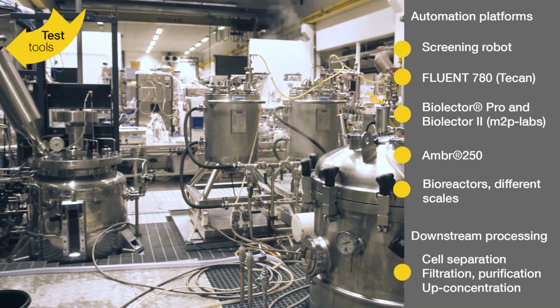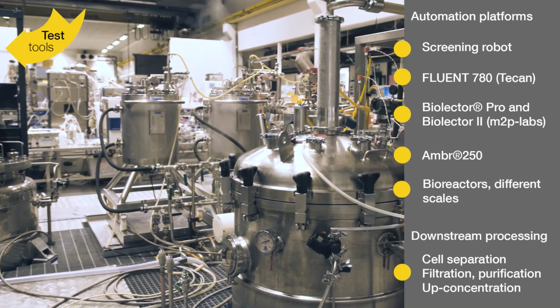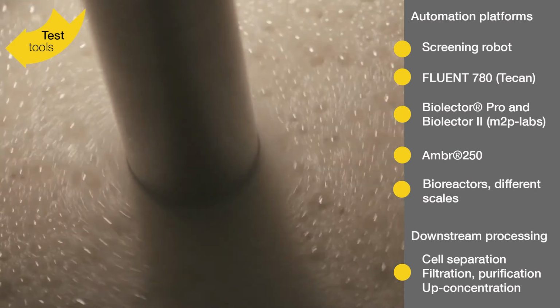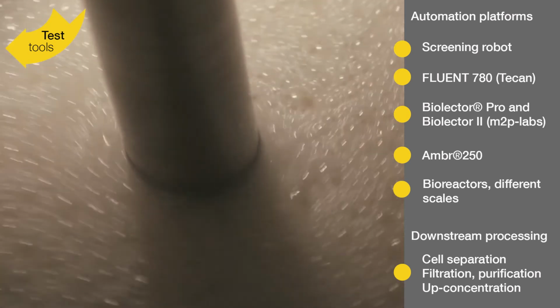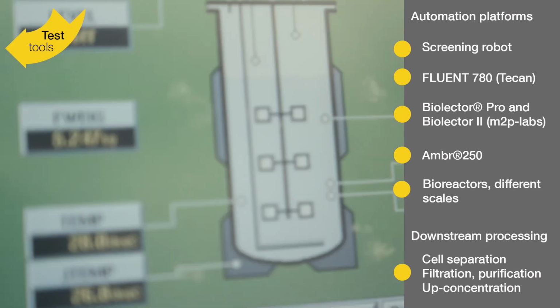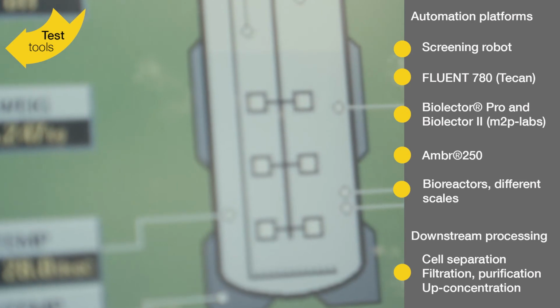When scaling up, what kind of challenges are met when dealing with larger volumes? Especially when we talk about process scale-up, there are several things we need to take into account when the reactor size is increasing, like mixing is a typical issue in the process scale-up, and aeration. Microbes often require a lot of oxygen input, and that can be challenging when you scale up the process.